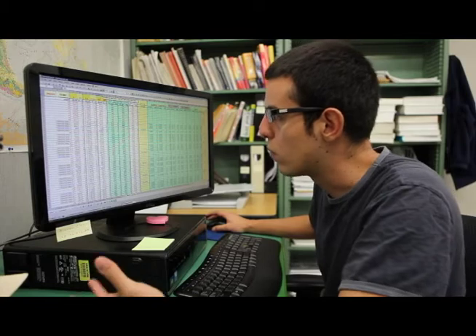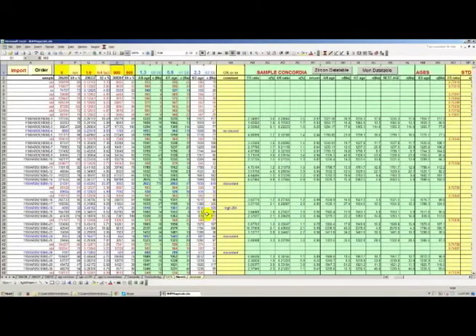So what we want to do is evaluate our data, this particular data set, and see what kinds of ages we have and where we want to set this parameter. Okay, so in order to set the right threshold for the age cutoff, we're going to use Isoplot.